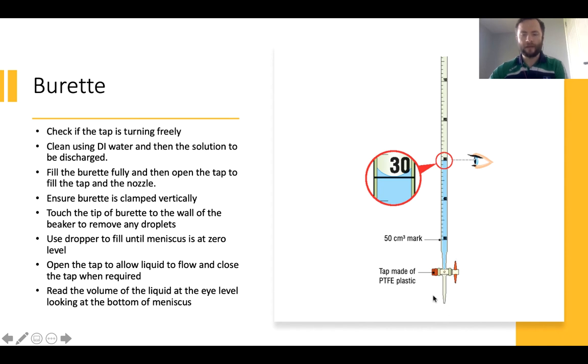Finally, once the endpoint is reached - once the indicator shows us that the titration or the pH of the solution changed or the required change has completed - we need to read out the volume with eye kept at the level of the meniscus.